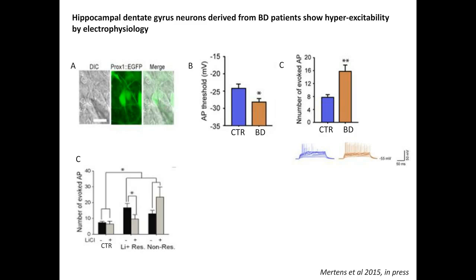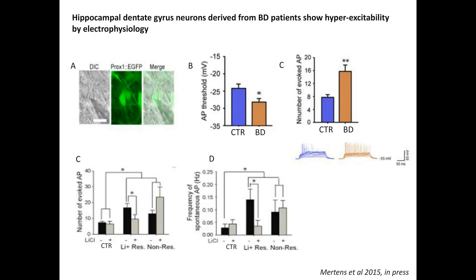Additionally, the two bipolar groups had hyperexcitability, and only the lithium treatment reversed the hyperactivity in the bipolar patients in the responsive group, but not in the non-responsive group, as shown in the bottom two graphs.